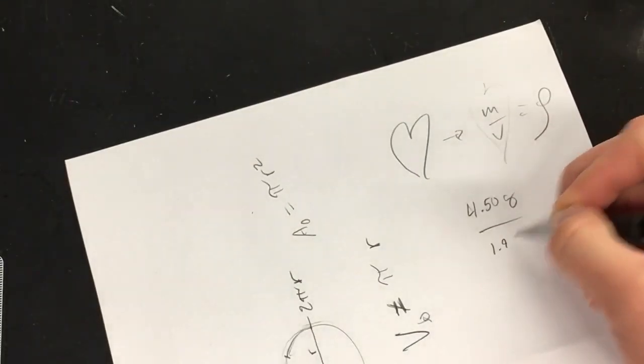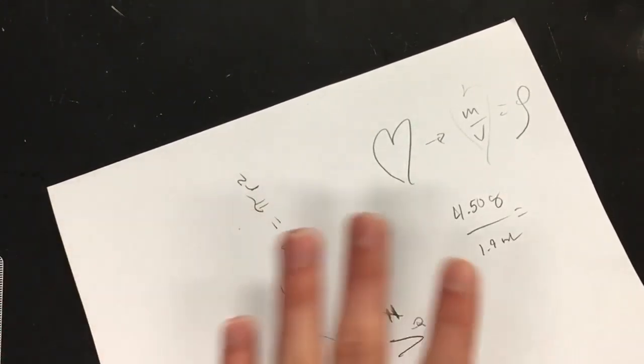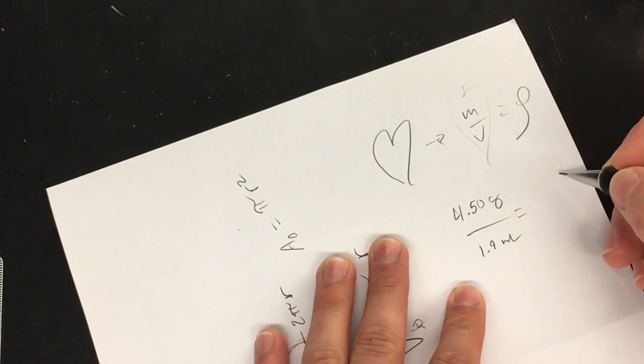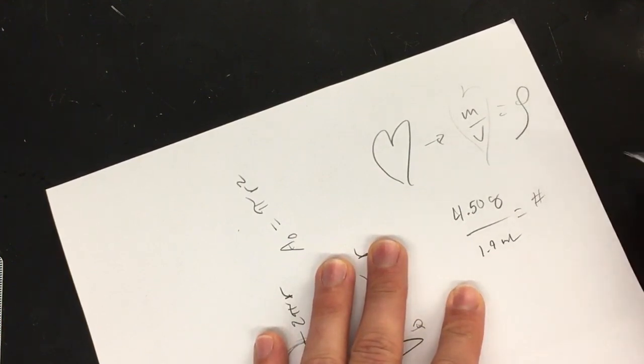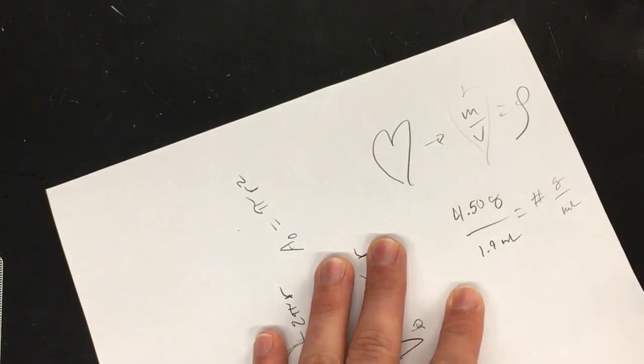I can't even remember two numbers for 5 seconds. 1.9 milliliters. And I'm not going to bother punching this into a calculator. That's not the point. I would get some number. And look here, my units would be in grams per milliliter or grams per cubic centimeter. And that's the important part, is that I obtain some sort of a density.